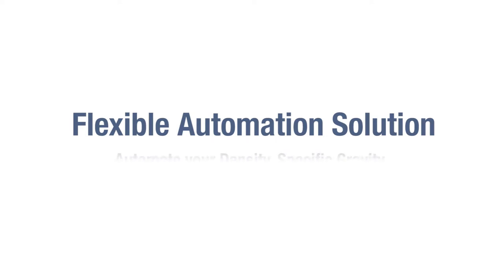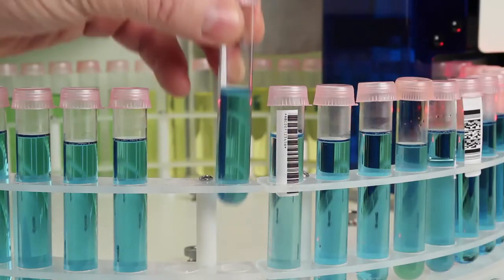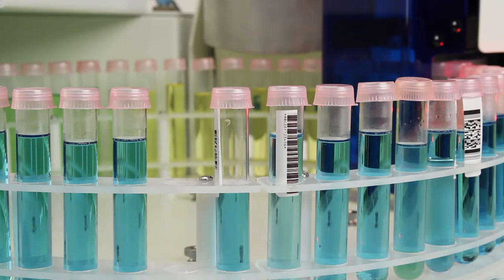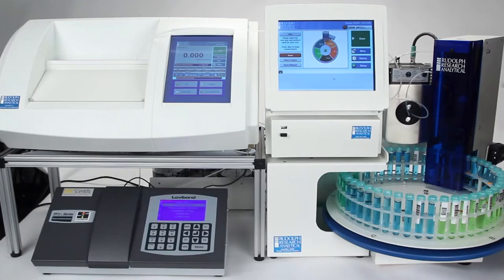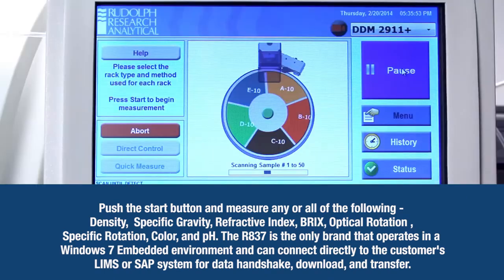The R837 is a flexible automation solution. Automate density, specific gravity, optical rotation, specific rotation, refractive index, color, and pH measurements. Simply push the start button and measure any or all of the following: density, specific gravity, refractive index, Brix, optical rotation, specific rotation, color, and pH.